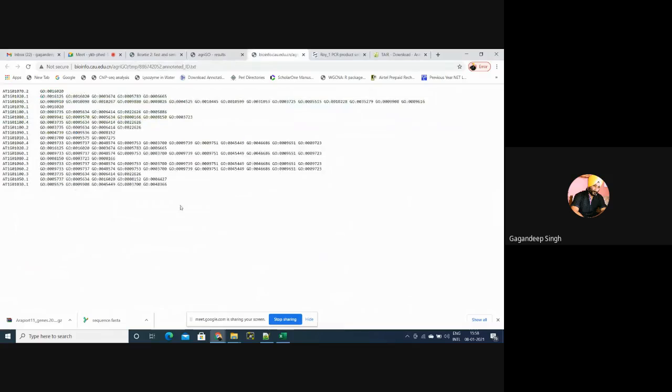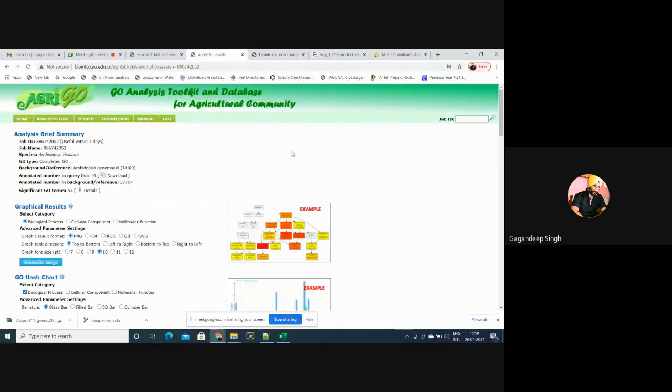That is what I have. From this particular tier ID, this is the gene ontology. Now, what is this gene ontology? How can we find the result of this gene ontology? So what will we do? We'll see the biological processes, cellular components, and molecular functions. First of all, we'll generate some details regarding biological processes. We can generate an image as well, and we can download the details from this as well. First of all, we'll generate the image.